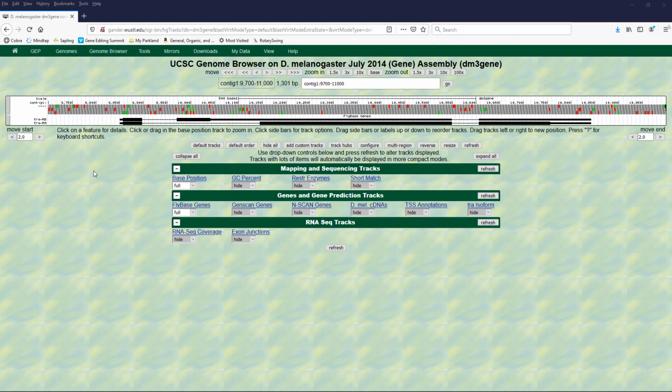So what can you see that's different? Just tell me basically in just a few words what is different between transformer RB intron 1 and transformer RA intron 1. Pause the video and answer that question.